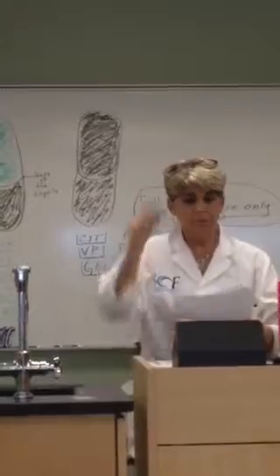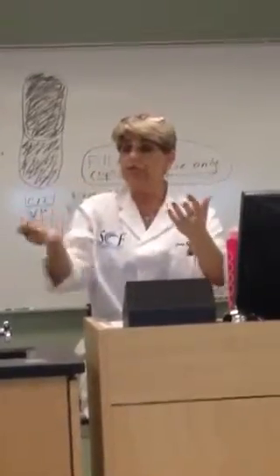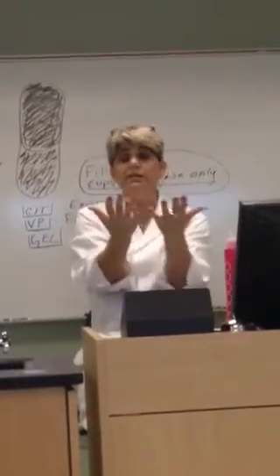Do we need to know anything on the liquid medium? Broth is liquid medium. That's it? Agar is solid medium. Okay. On your solid medium, I took a sample from my broth. I streaked it out over the plate. Do I see anything there?